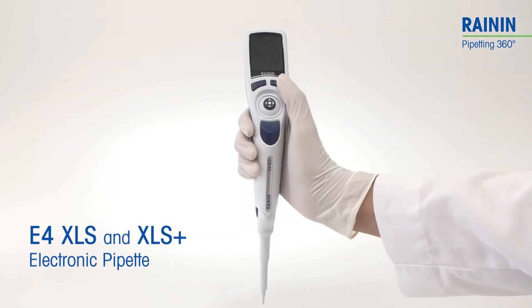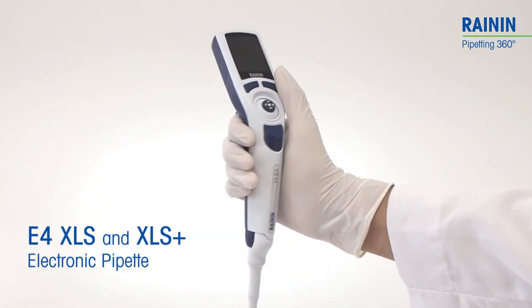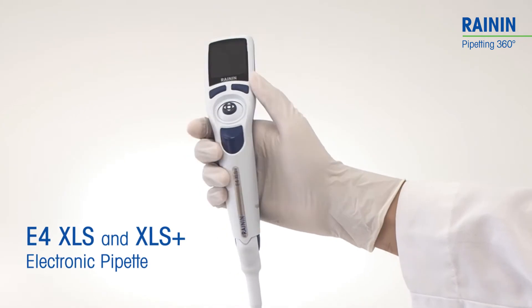Congratulations! You've just picked up a simple to use, highly capable pipette, the Rainin E4 XLS and XLS Plus.